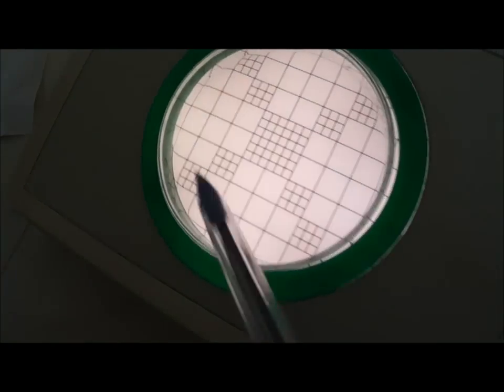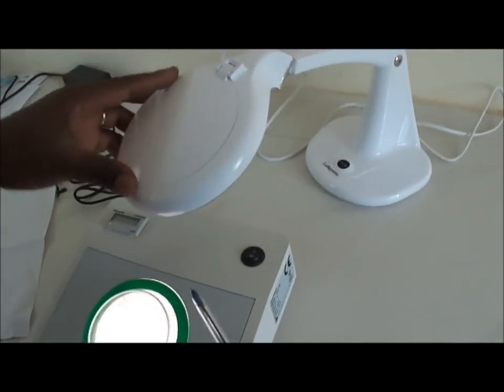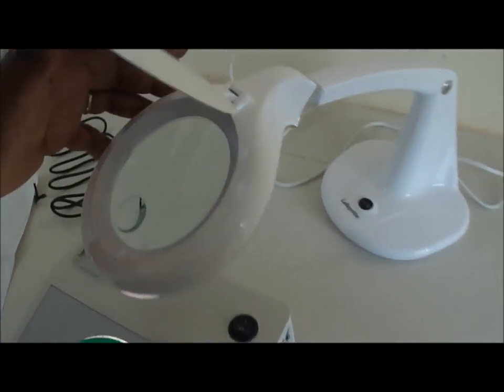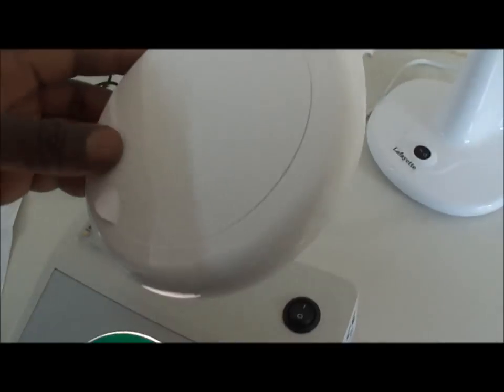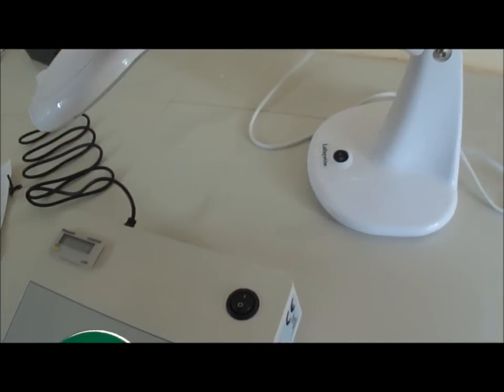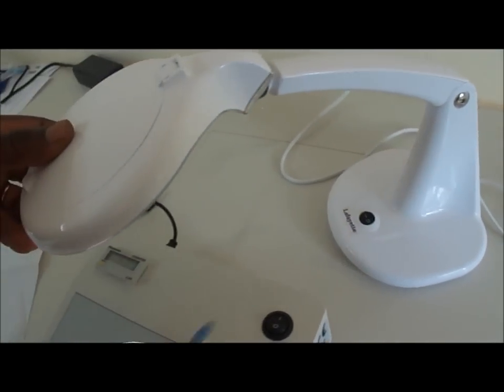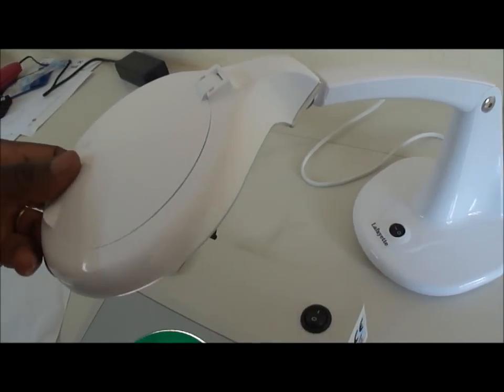Now, sometimes, even with that, the number of groups or colonies are so many, that you cannot easily count them with your naked eyes, then you use this device, that's a magnifying device, the model we have here is this one.